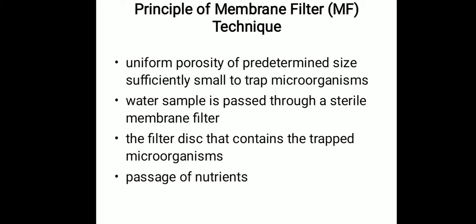The discrete colonies thus formed can be easily transferred to confirmation media. Following incubation, the colonies present on the filter are counted with the help of a microscope.